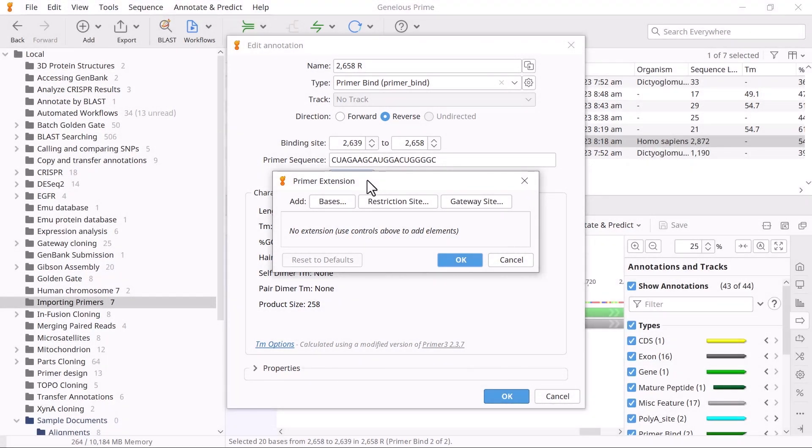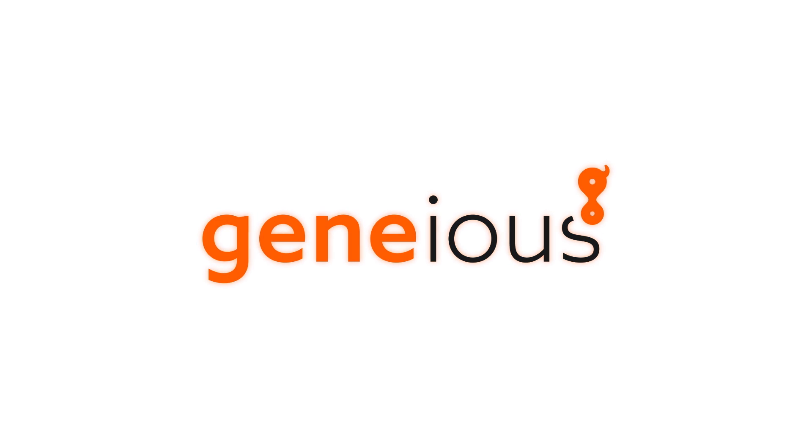And that's how you design primers with five prime extensions in Genius Prime. To learn more, visit Genius.com.